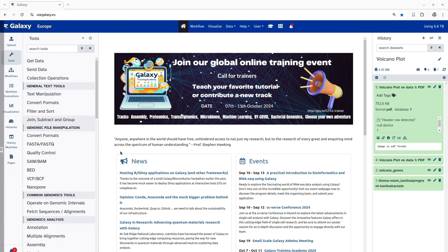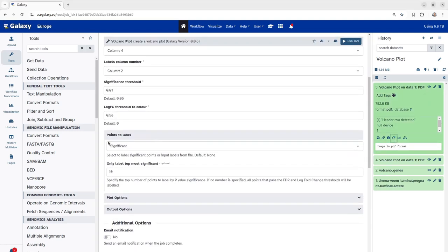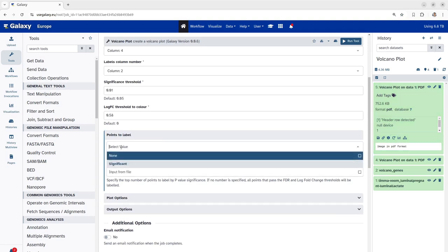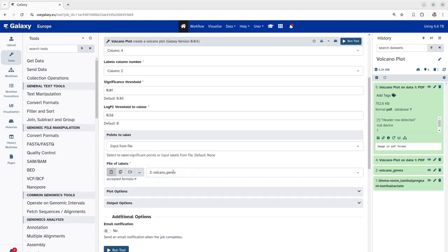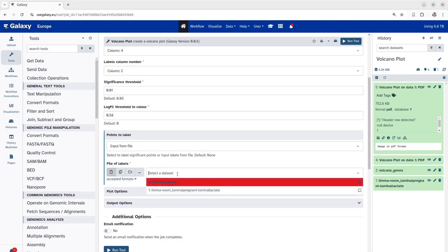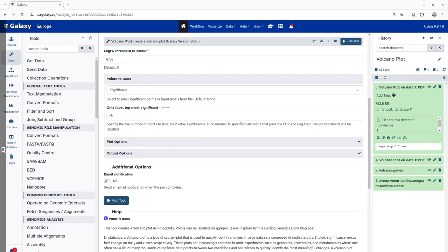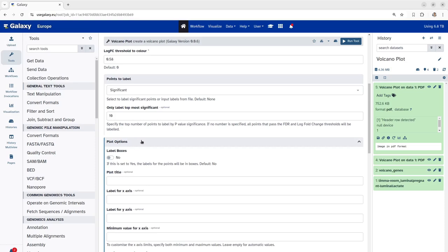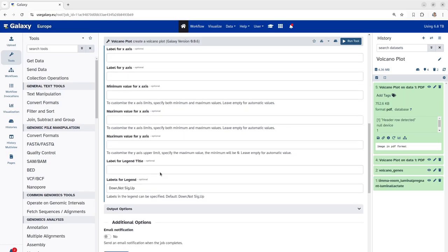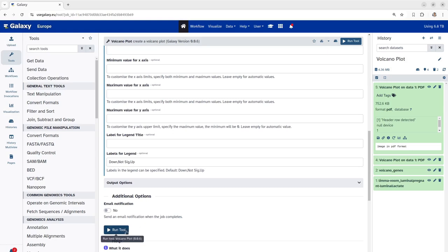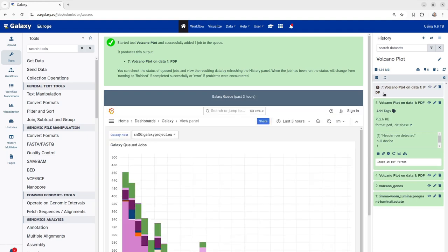We will click on the rerun button of the volcano plot tool and scroll down to the points to label. In this parameter, we will select points to label as input from file. As we have our list of significant genes into volcano genes file, we will select the volcano genes file here for our labels. Next, in the plotting options, we will select the label boxes to yes and proceed with running of the tool. Let's wait until this completes and then we can visualize our volcano plot with a list of significant genes of our interest.